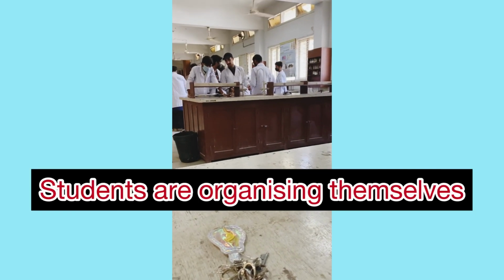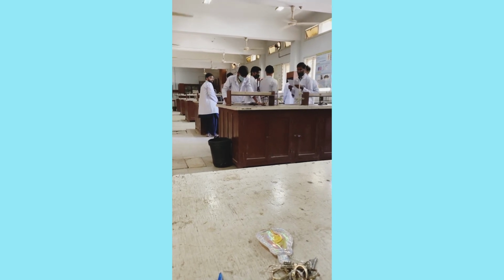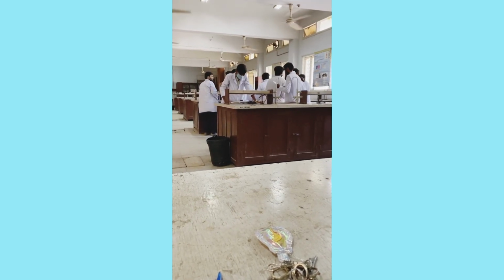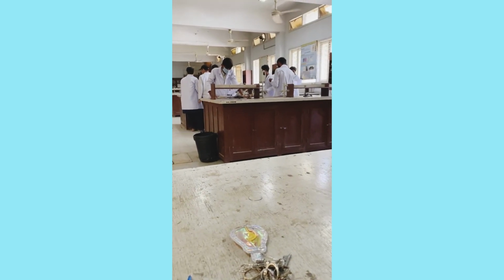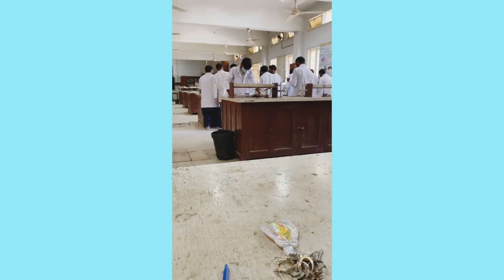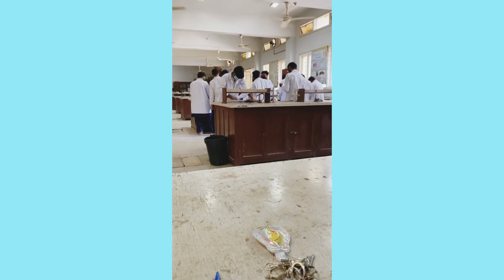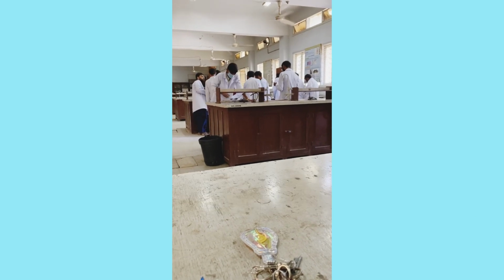So this is the part 3 lab, BS part 3 organic chemistry lab. Like always, I have just taught them every step of the chemical reaction. They are going to start the organic preparations today. So this is it. And now this is their second day. They attended their general introduction, and today is their second day, but the first day of the experimental work. So they are going to divide themselves into different groups, and then they are going to work. These are the girls, and this is the boys' side.